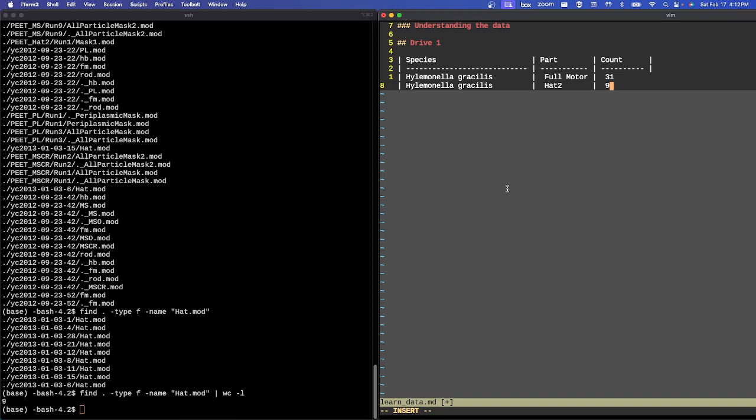And then the other thing I want is a little bit easier, but you probably even had this question already. How do we have multiple mod files for a single run that only has one MRC, then what has one rec file in it, right? That one reconstructed file. So apparently, in some they'll have a full motor and a rod.